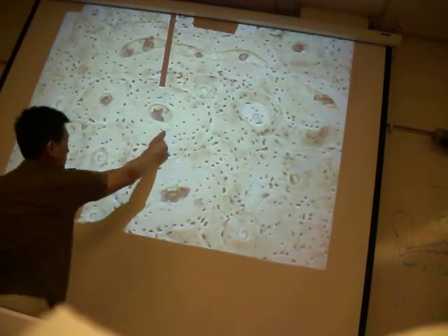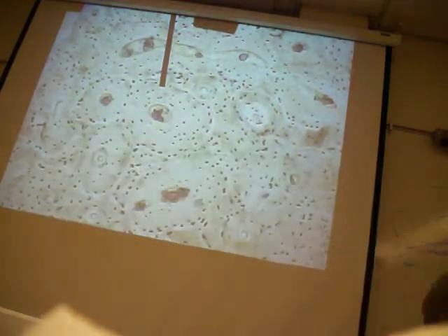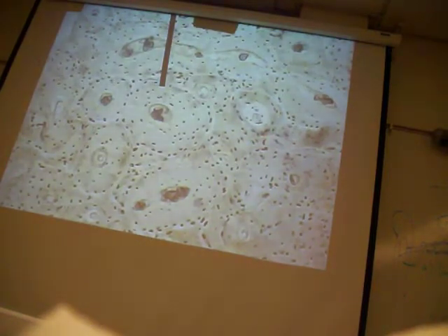So you see this portion right here, inside this area, this is called a lacunae. Within the lacunae, you will find the osteoblast. Lacunae is just an opening. So this is an opening right there, but within the lacunae, you're going to find the osteoblast. What the osteoblasts basically do is they produce that bone material. In this bone material, they're going to put down the phosphates and so forth and make it nice and dense.